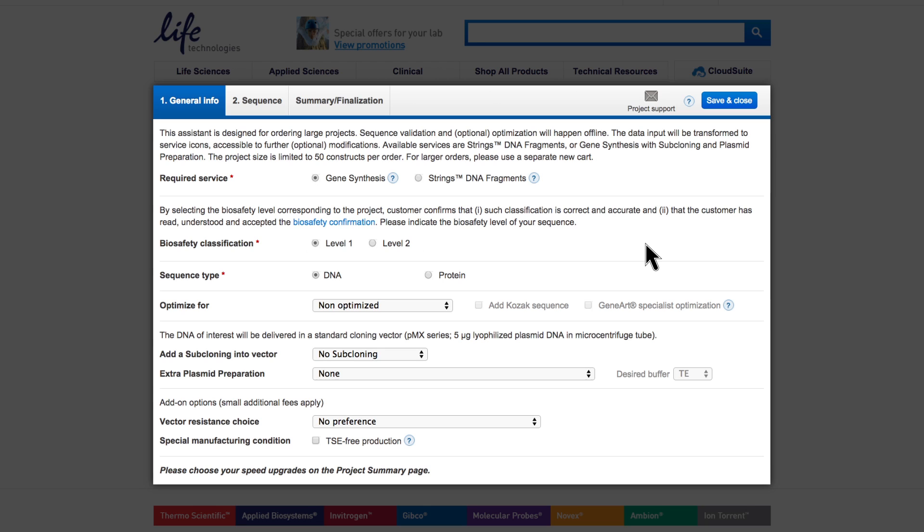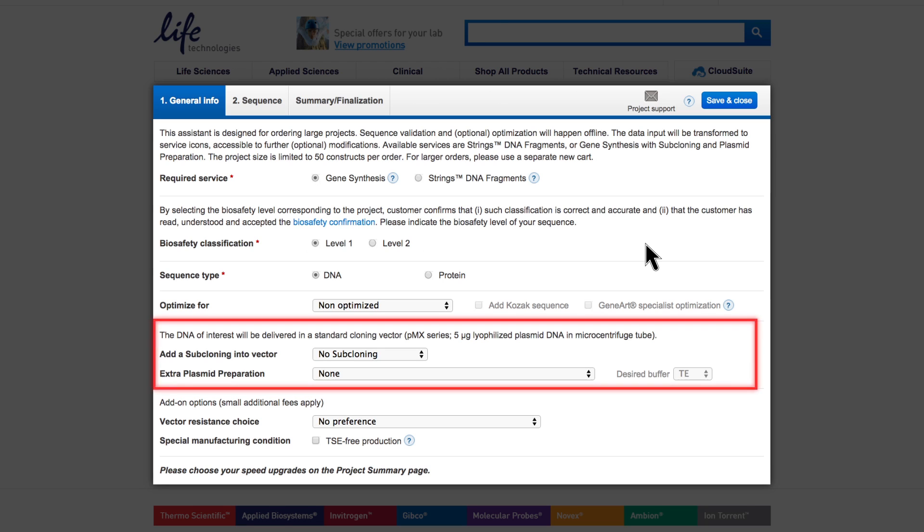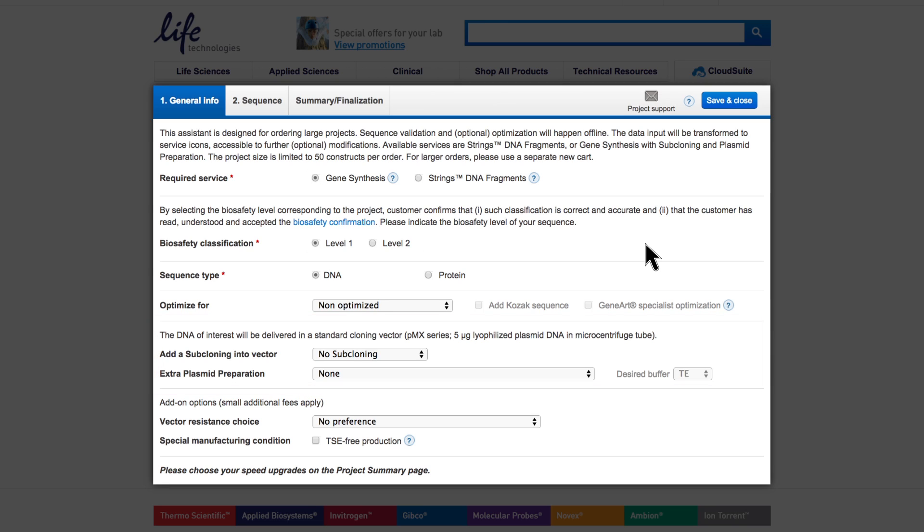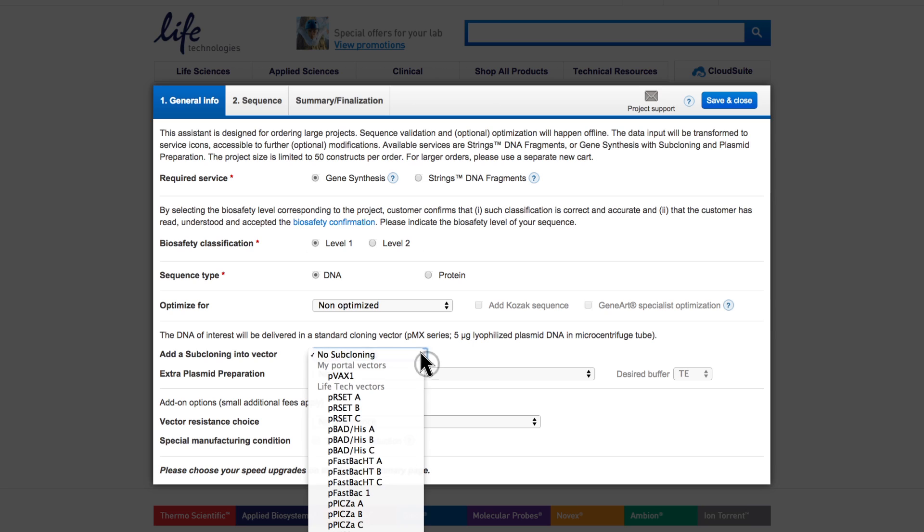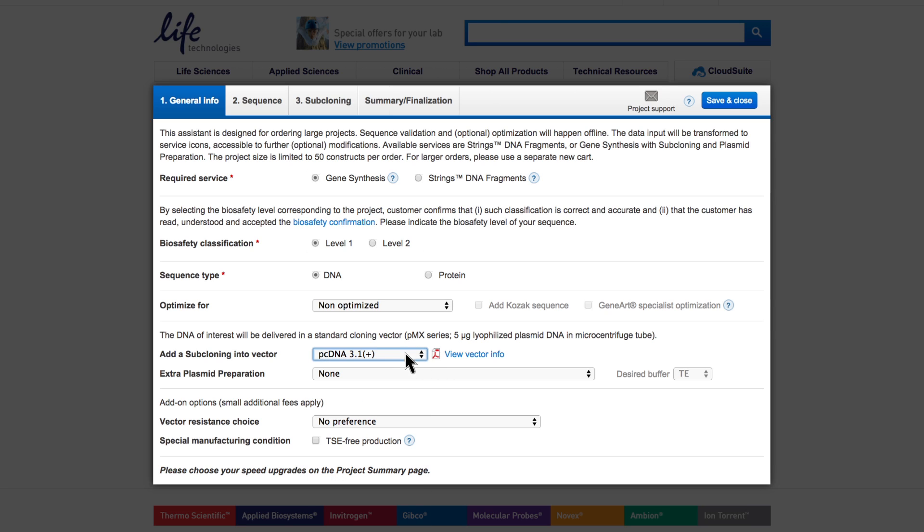The following section allows you to order subcloning and larger plasmid amounts. Please note that an input tab for subcloning will only show up if you select a vector here. For subcloning, you can choose from a selection of our popular Invitrogen expression vectors. A list of your individual vectors will also be available once you have stored them with us.